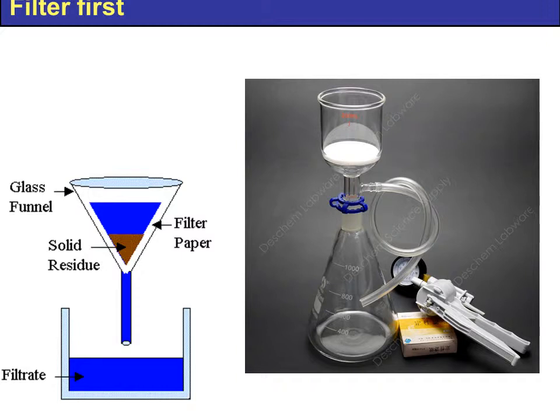The first thing you would need to do after you take this powder and mix it with water is to filter it. So you will filter this stain through a funnel. You want to make sure you filter it so that you can trap all the undissolved crystals into the filter paper. If not, you might accidentally see a crystal and think it is a microorganism.